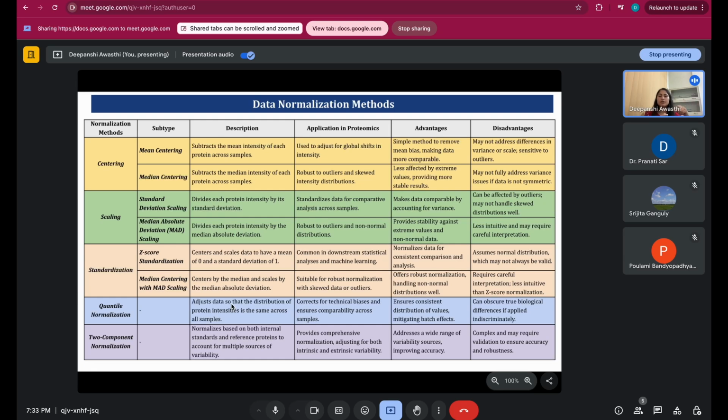And at the same time we are also removing the values which are not of any importance, which are just the contaminant values, the far outliers. So we can ignore those values which are just biasing our distribution. Because if there should be a Gaussian plot or a normal distribution, due to the outliers that distribution appears to be skewed, because your outlier is lying far away from your values. So in that case it shows that there is a skewed distribution.